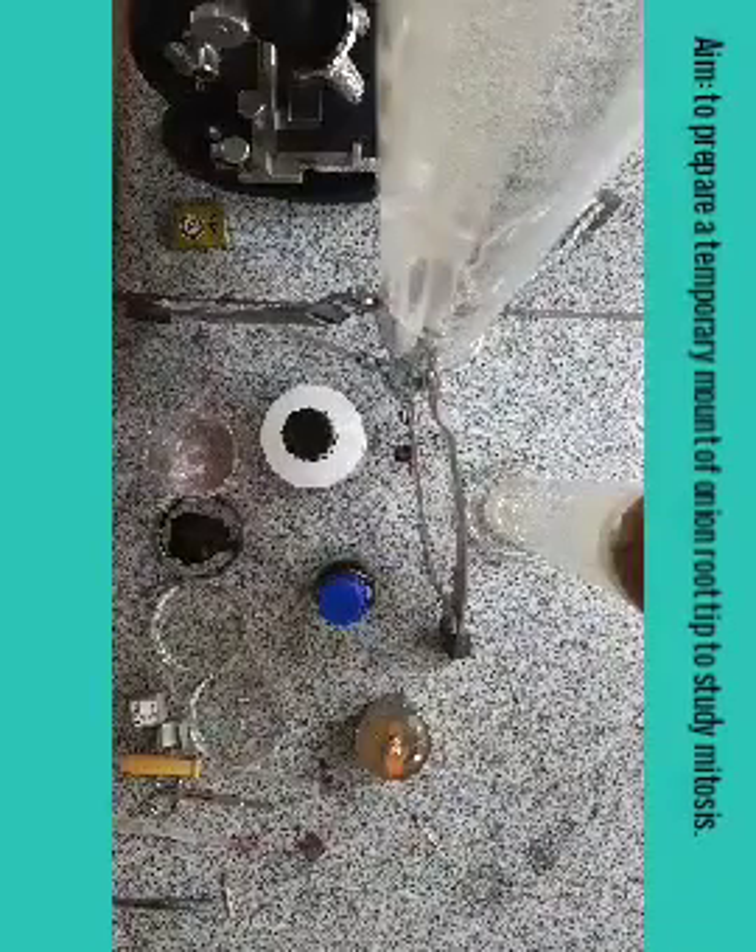Good morning dear students. Today we will study how to prepare the slide of onion root tip for studying the different stages of mitosis, like prophase, metaphase, anaphase, and telophase.